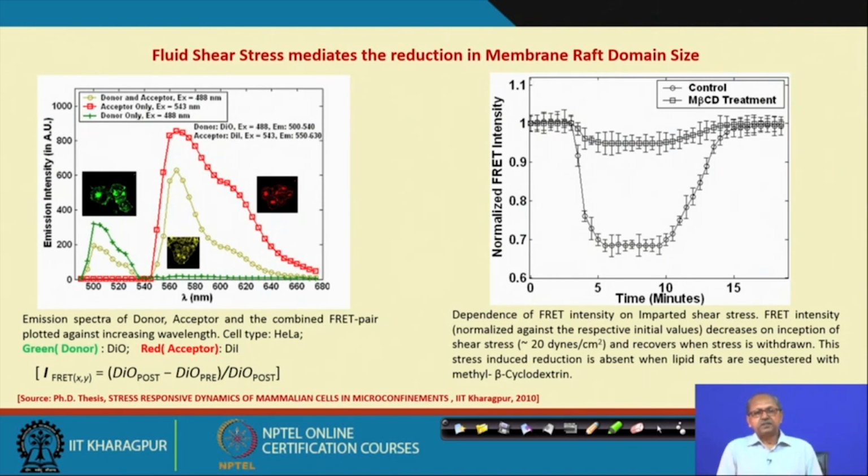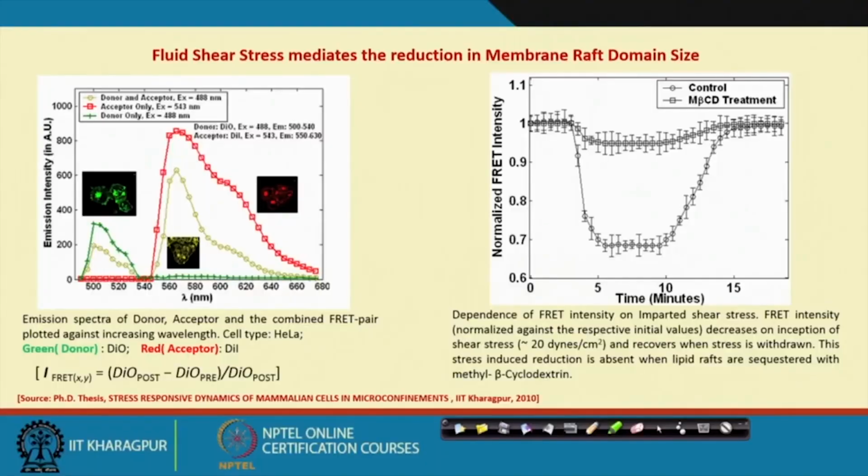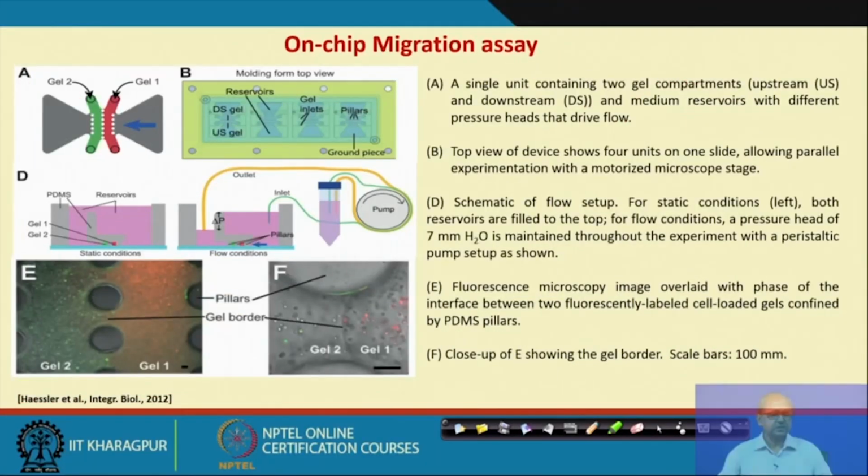Besides these experiments, there are some experiments undertaken in microfluidic platforms to assay cell migration. Particularly in the tumor environment, cell migration is very heterogeneous. To understand that heterogeneity of cellular migration, the microfluidic platform is very important, rather than the macro-scale Boyden chamber. So, what strategy is undertaken in that process?